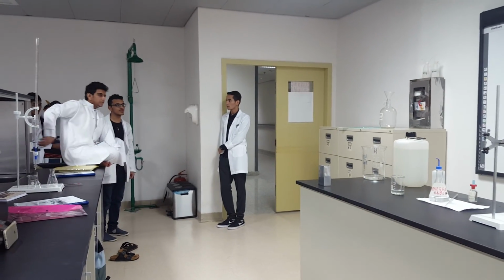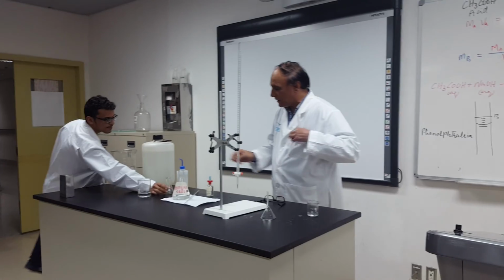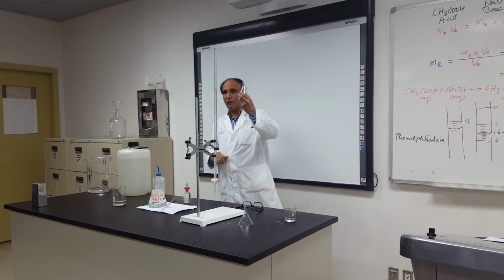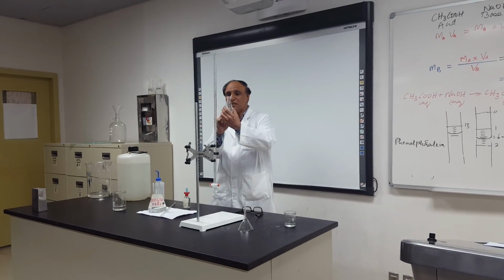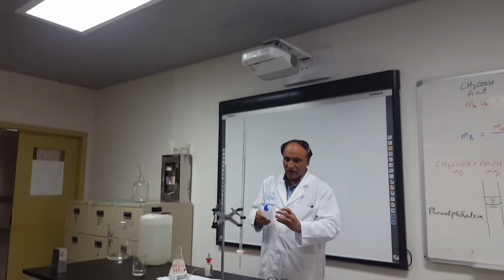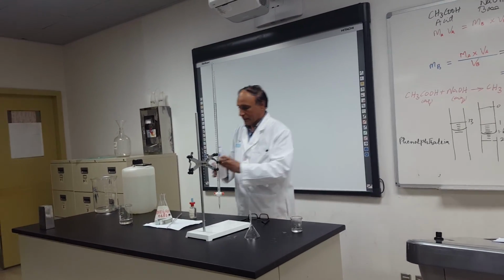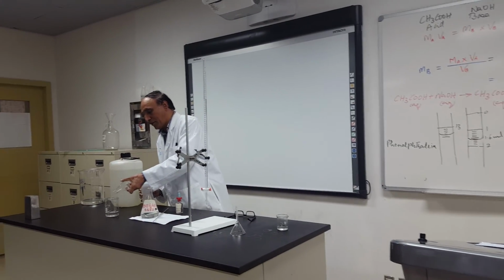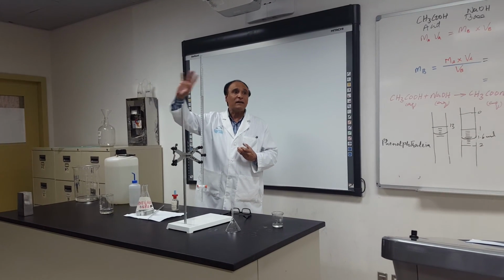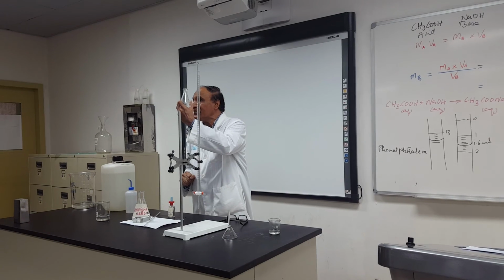Now, give me. I will do this. Now, when you wash it with the tap water, now you tell me what to do. What do I do now? Wash. This is washed with the tap water. What to do? Wash with acid. Okay, wash with the distilled water. All right. You are going to tell me. Wash it with acid. No, wrong. Listen. I didn't wash with the acid. You know, I only wash with the tap water.